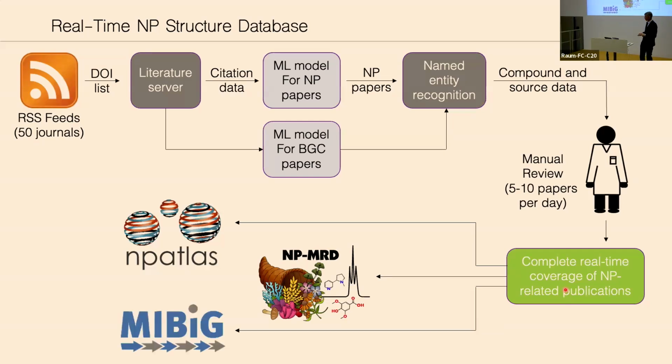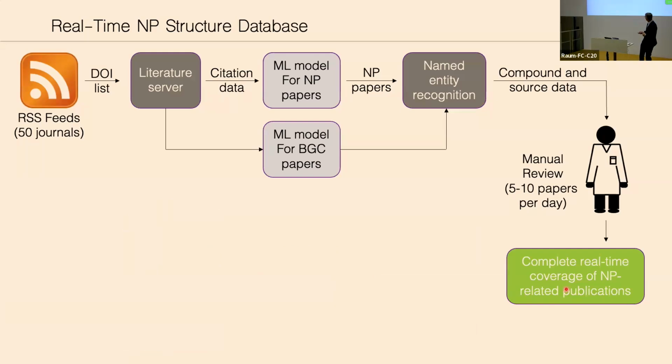There's no reason really why we can't also feed those data to other databases like MIBig. At the moment, every time they do a release, I spend a summer reading biosynthesis papers in order to make the connections properly, which is quite time-consuming. So you can imagine that in the future, that's one possibility for federating the data to domain-specific experts, but helping the large-scale curation to be done at a systems level, at a domain-specific level. And then lastly, at the moment, we only collect NMR data.